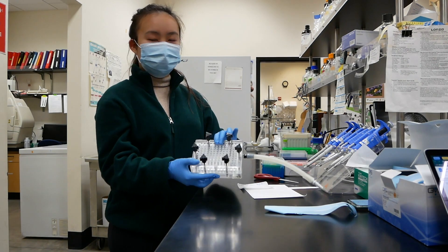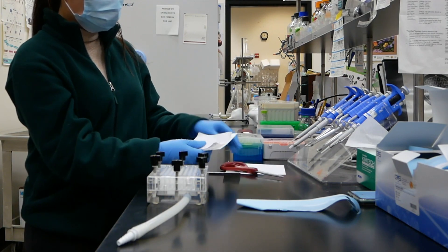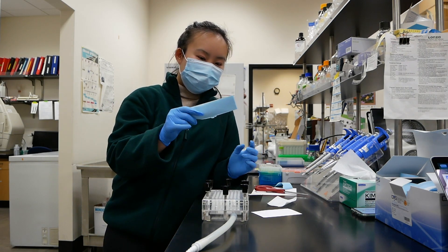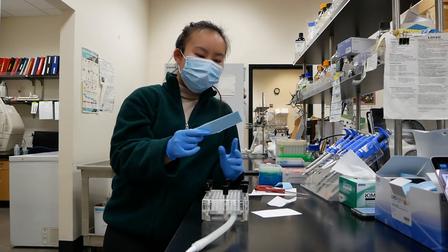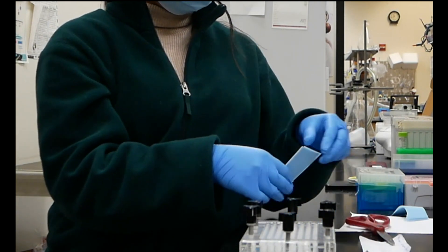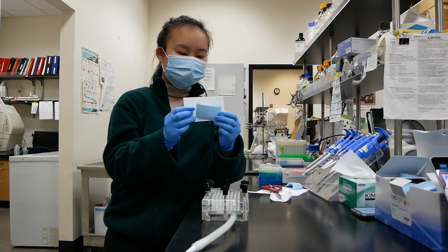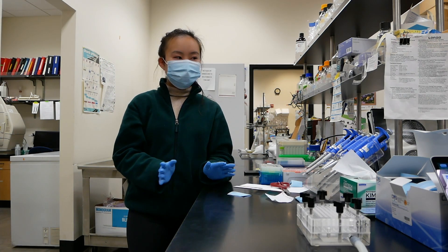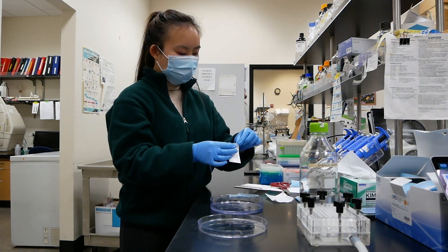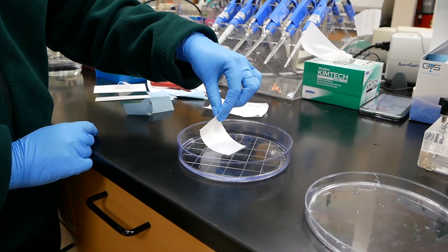First you want to cut out a piece of Whatman paper that will cover the entire surface area of the holes. Now we want to make sure to cut out a piece of the nitrocellulose membrane. We need to cut out enough to cover the entire protein extract, and we need to make sure it fits within the Whatman paper as well. Now we're going to soak the nitrocellulose membrane — start with one corner in the water first and gradually let the water creep up.